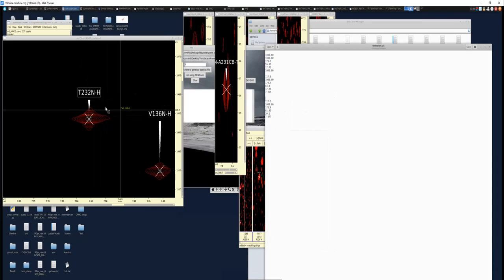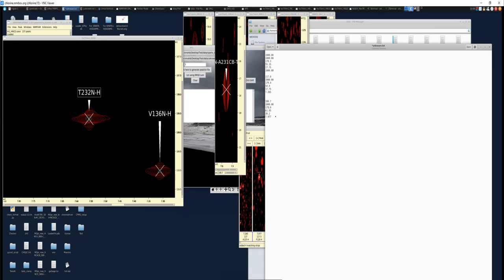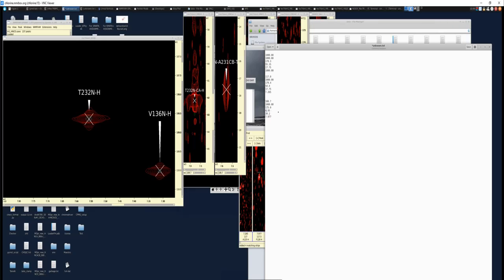and let's input its information, right? So say this is 108.7, right? And the carbonyl is 175.0. The C alpha here is 62.25.